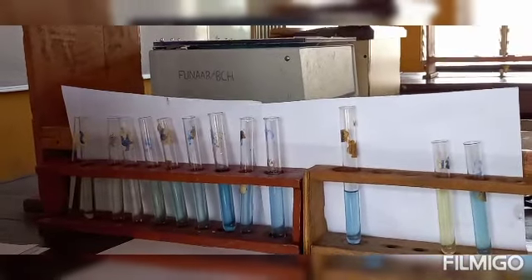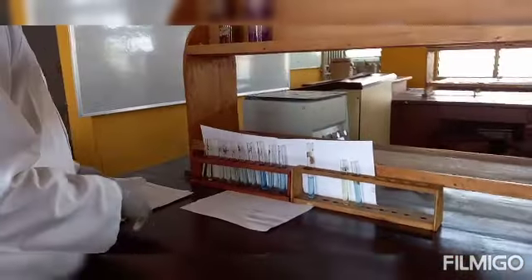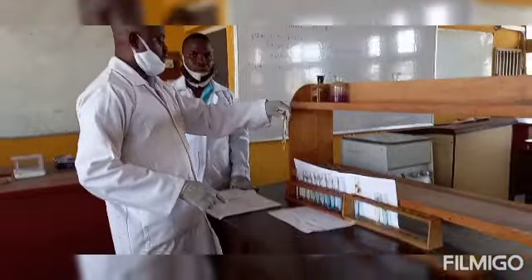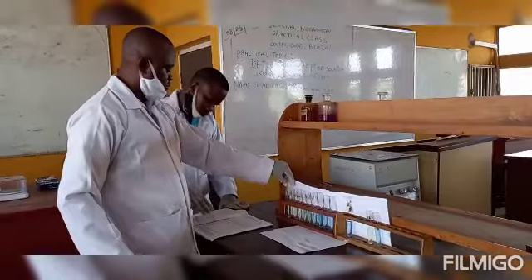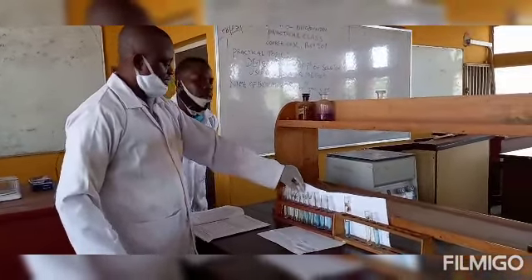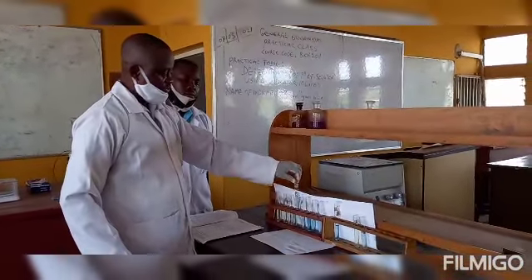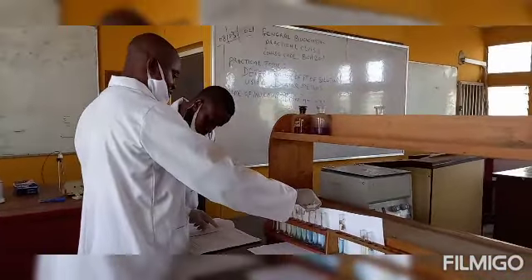Now to determine, having prepared this standard from tube 1 according to our table and phosphate buffer standard on page 8 in our manual, tube 1 is standing for pH of 6.0, tube 2 is standing for pH of 6.2, tube 3 6.4, tube 4 6.6, tube 5 6.8, tube 6, as you can see the color, 7.0, tube 7, what's the next tube now?